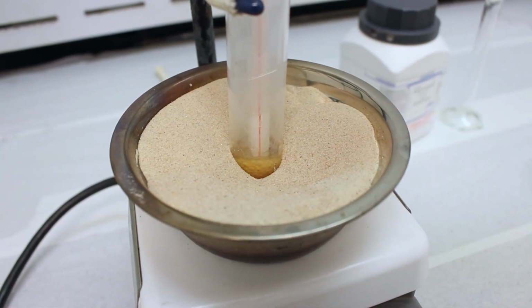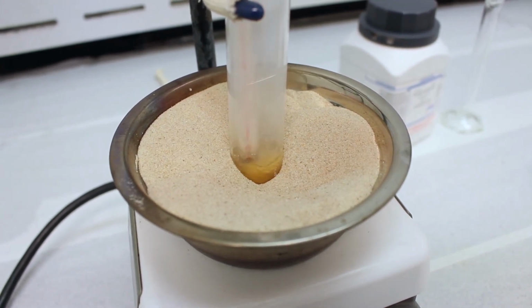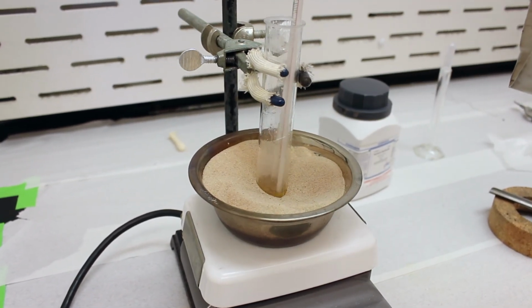So the goal now is to keep it at that temperature for a duration of 5 minutes, and that should be sufficient to ensure the reaction goes to completion. So we'll continue to stir for 5 minutes, and then we'll take it off the heat and we'll work it up from there. Okay, so we've completed our 5 minutes of reaction.